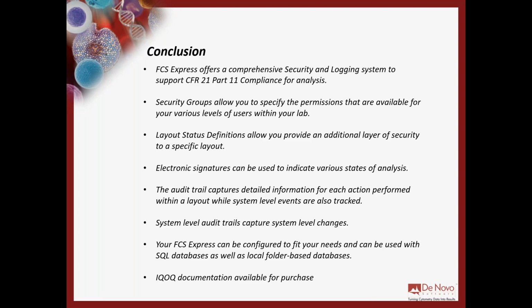So remember that you're not 21 Part 11 compliant just because you add these things onto the software. They're tools that are going to help you meet compliance by meeting the regulations laid out in that matrix that you need to implement at your site. And we do that by using the security groups that are going to allow you to specify and leverage the permissions that are available for your various levels of users within your labs.